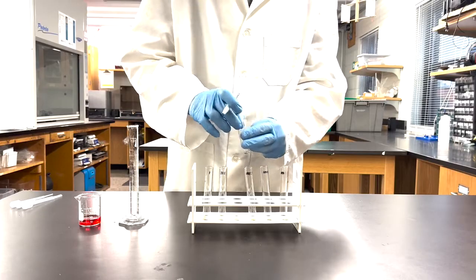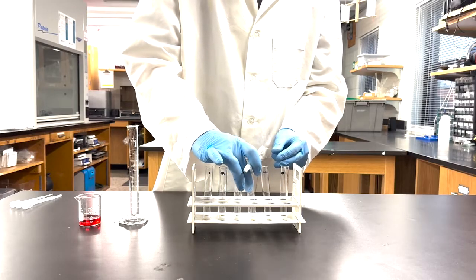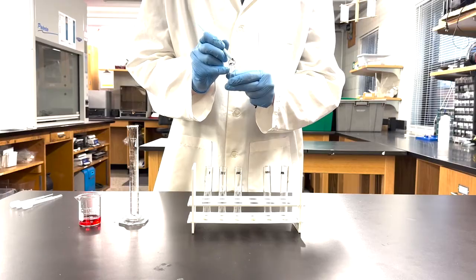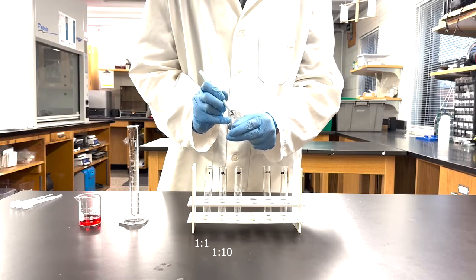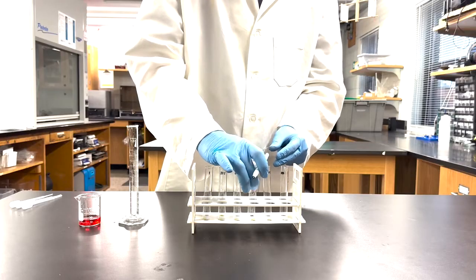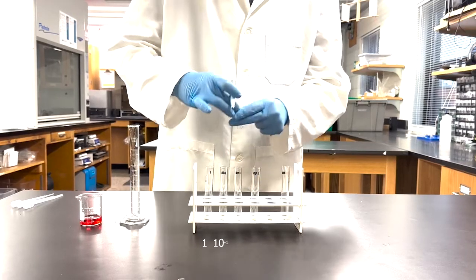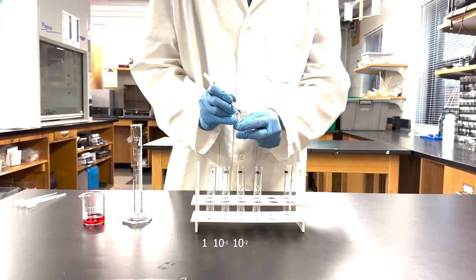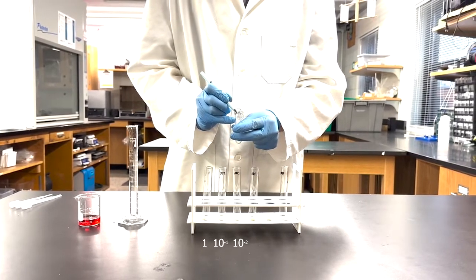Label each tube in the series with the concentration it will contain. These can be noted as a ratio such as 1 to 1, 1 to 10, or 1 to 100. Or they can be noted as scientific notation: 1, 10 to the negative 1, 10 to the negative 2, etc.